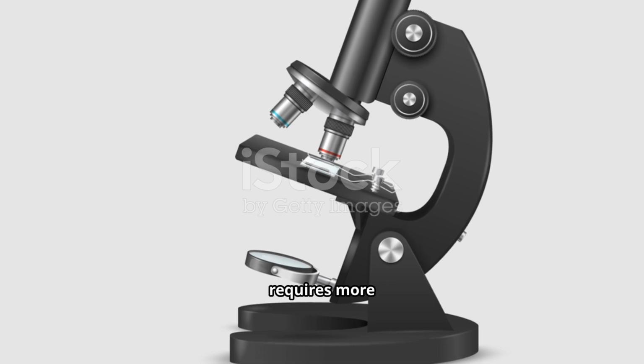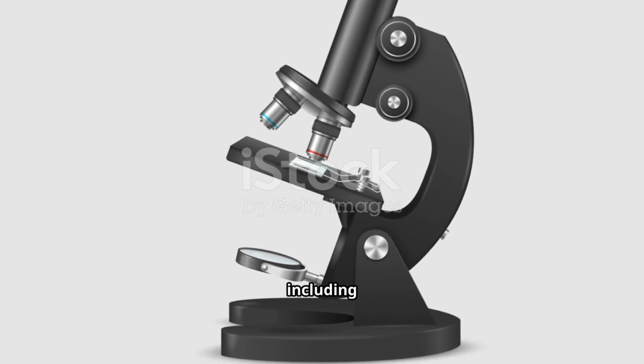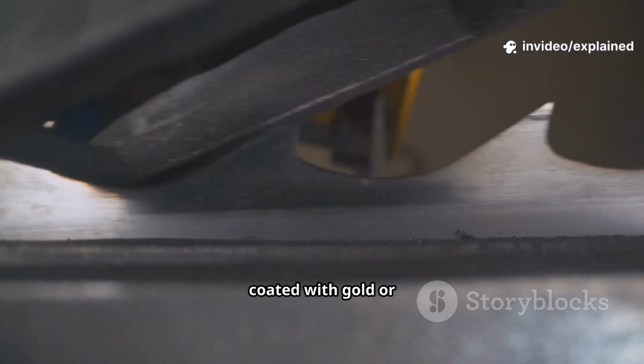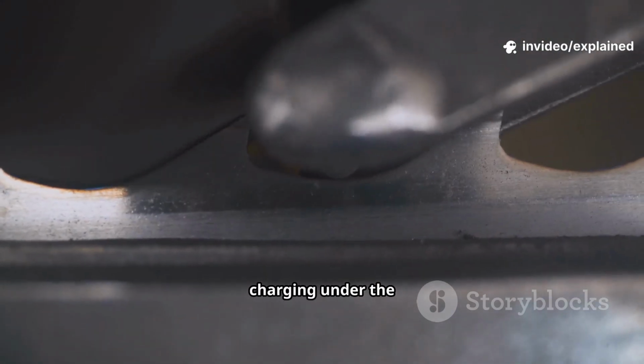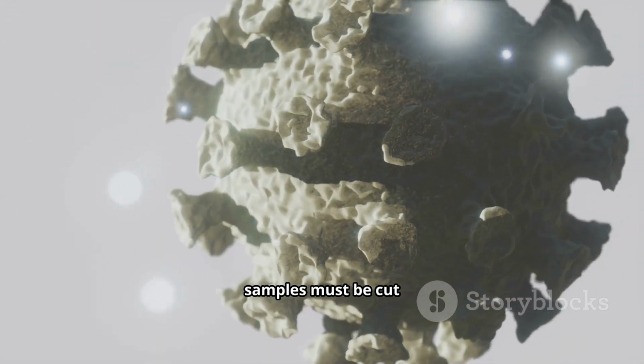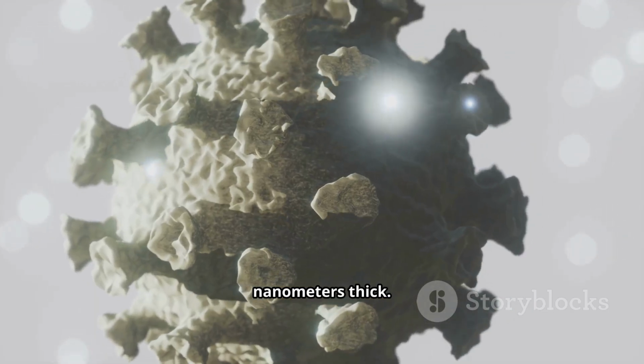Electron microscopy requires more complex preparation, including dehydration and coating with conductive materials. Specimens are often coated with gold or platinum to prevent charging under the electron beam. For transmission electron microscopy, samples must be cut into sections just nanometers thick.